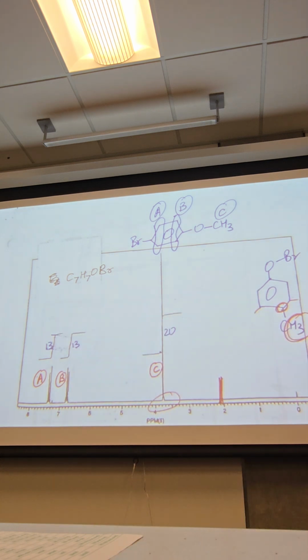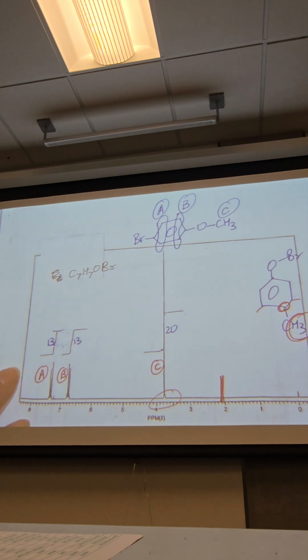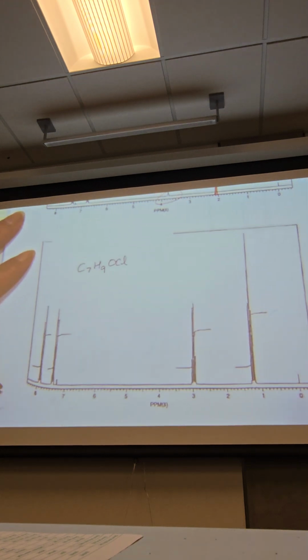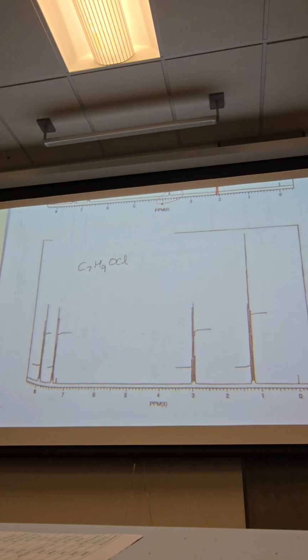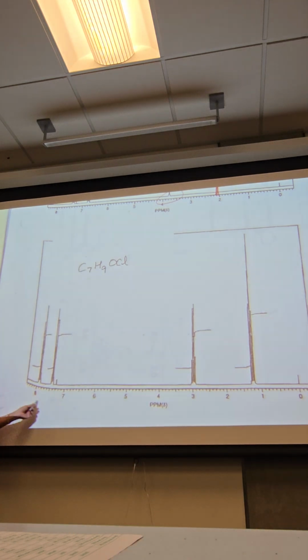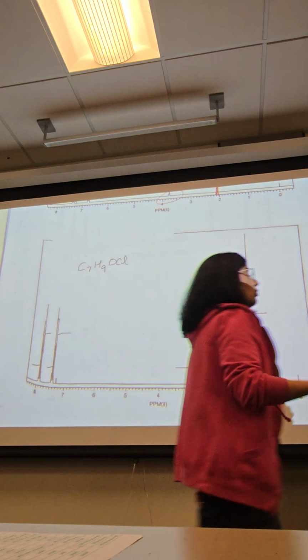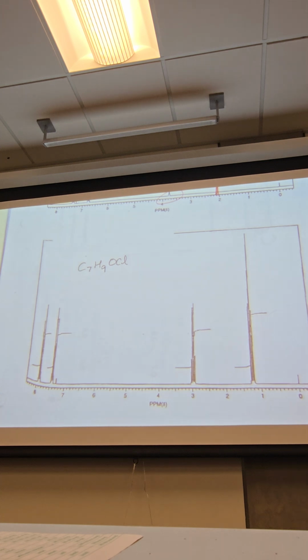Okay guys, let's try the next one please. IHD is equal to what? 3. I heard 3, not possible. Not based on this structure, spectrum. Guys, do you know why I'm saying it? Without even doing the math, is there a clue that told us 3 is not even possible? Who comes here? Benzene. So automatically 4. So 3 is not possible, right? It has to be 4 or more. So what's the IHD, please?